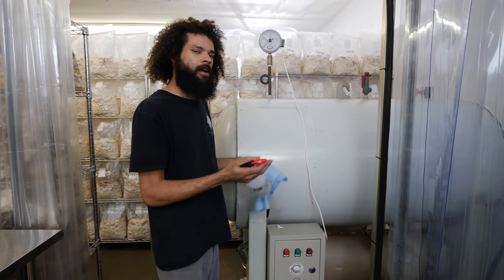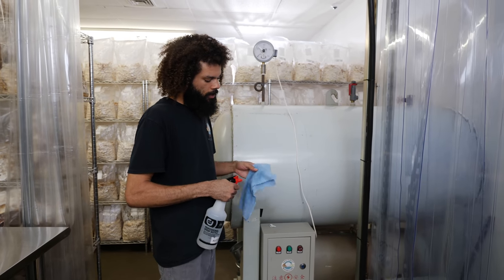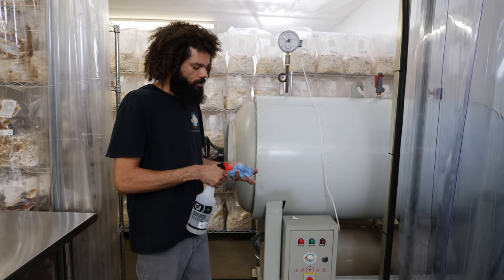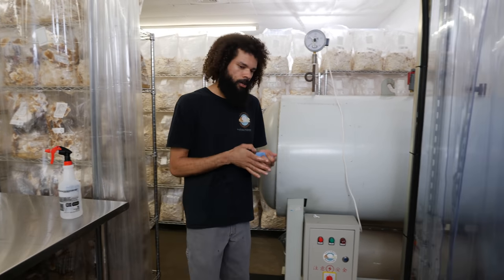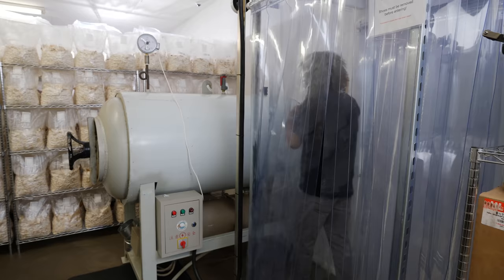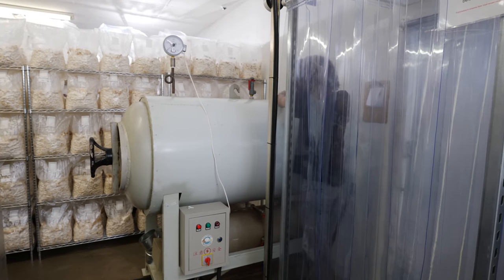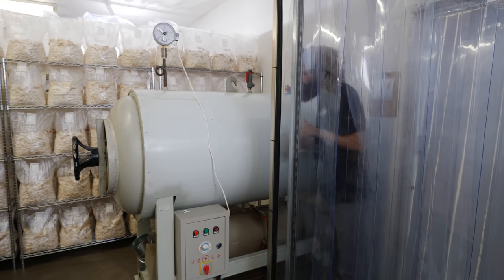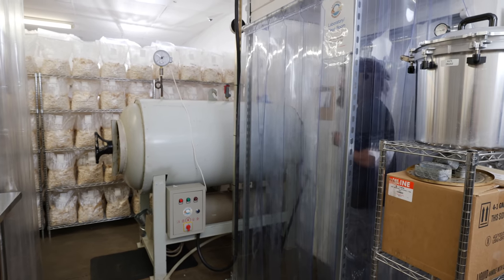Before opening it up in the lab, I'm just going to depressurize it. I'll take a fresh alcohol-soaked rag and open up the sterilizer from out here to depressurize the chamber, so when I go in the lab and open it up, there's no trapped pressure in there and it makes it easier to push the door in. I cover the top with an alcohol-soaked rag and open up the valve that escapes any built-up pressure, and if there's any chance for anything to escape into the sterilizer, it's covered with that alcohol-soaked rag.